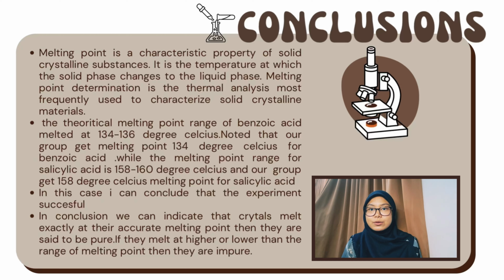In conclusion, we can indicate that if crystals melt exactly at their accurate melting point, then they are said to be pure. If they melt at a higher or lower temperature than the range of the melting point, then they are impure.